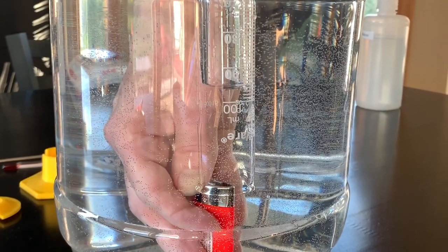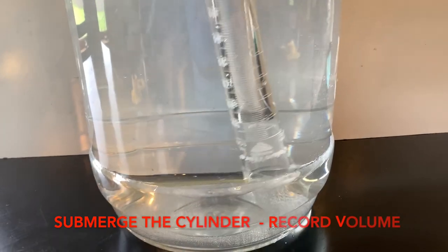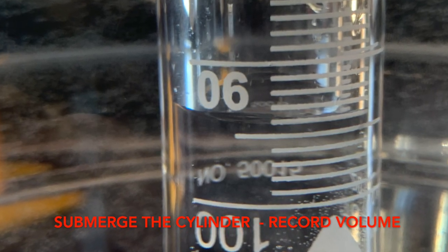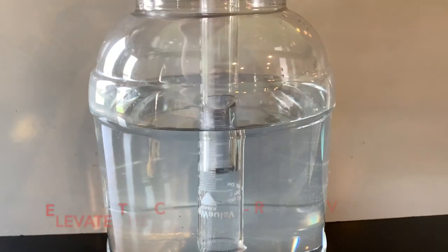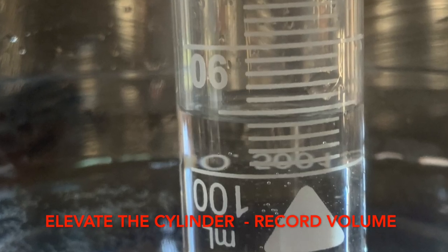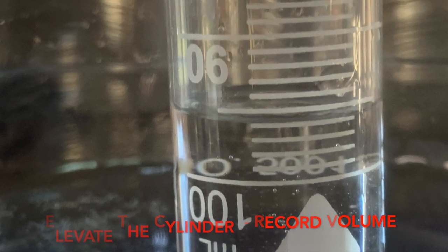After you've collected your sample of gas, put the grad cylinder all the way to the bottom of the water basin and you'll notice that the volume of the gas decreases because of increased pressure of the water. Next, elevate the grad cylinder. Do not remove it from the water level, though, and you'll see that the gas expands due to it being above the water level, which is the atmospheric pressure of the day.